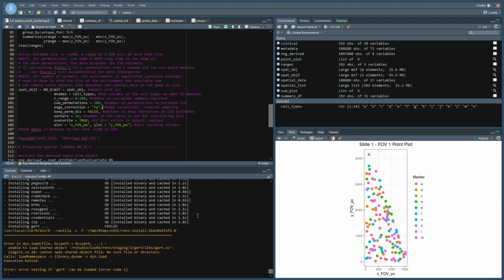So it should be up to 100. The way to interpret this is that at a radius of whatever, 50% of A are that far away.